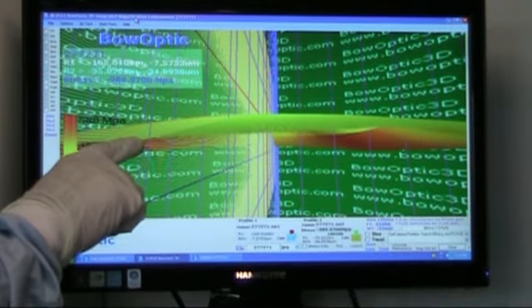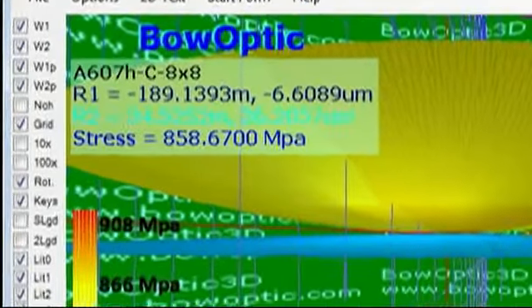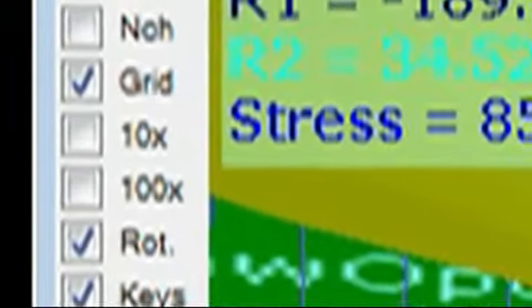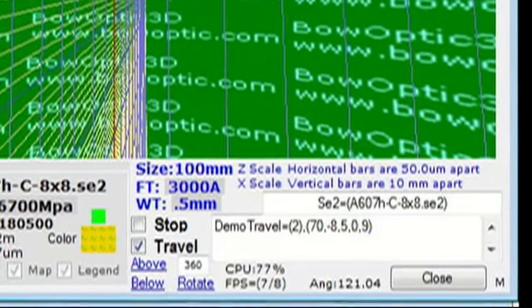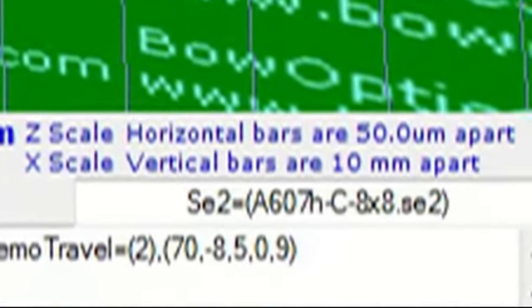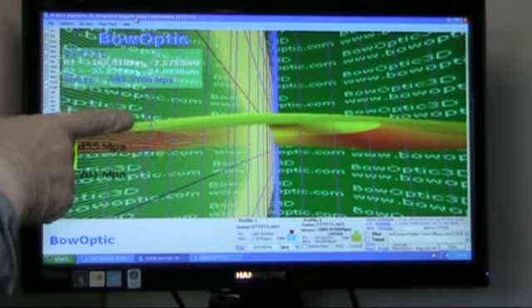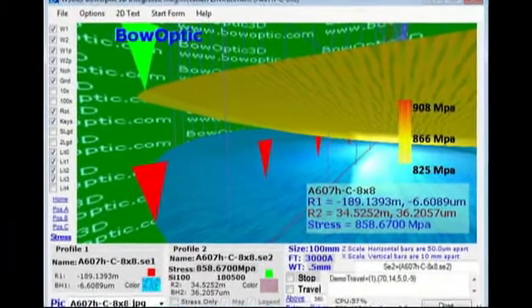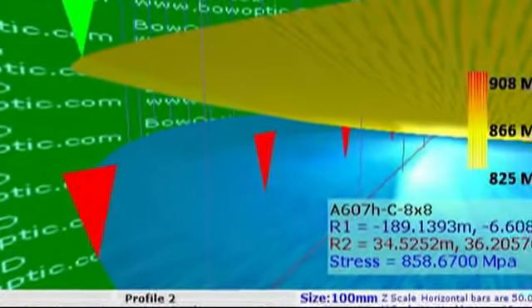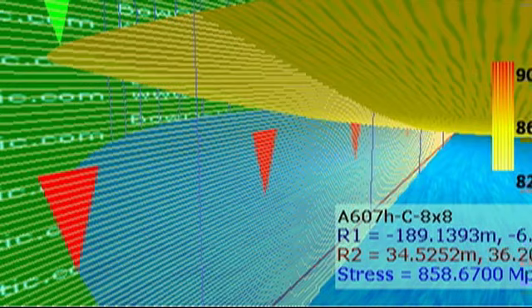Use the grid to measure the substrate in 3D. There's a 10x and a 100x grid that can be enabled with the controls on the left. The scale for the grid is below the 3D image and changes if the magnification changes. Move the decimal if a subrange is selected. A 50 micrometer grid with 10x selected is 5 micrometers per division for the subrange scale and 0.5 micrometers if 100x is selected.